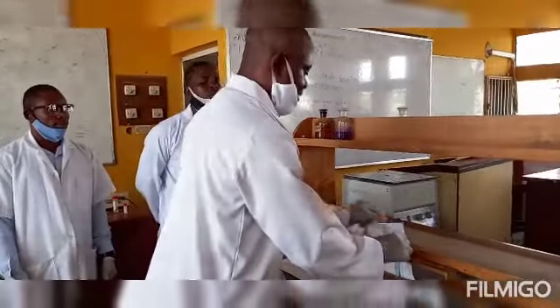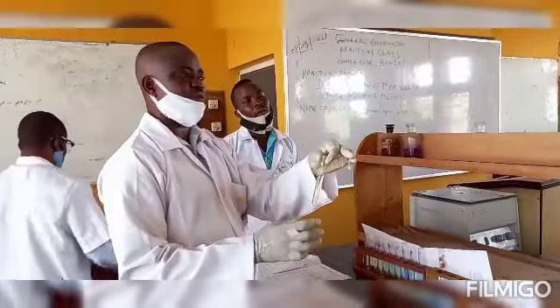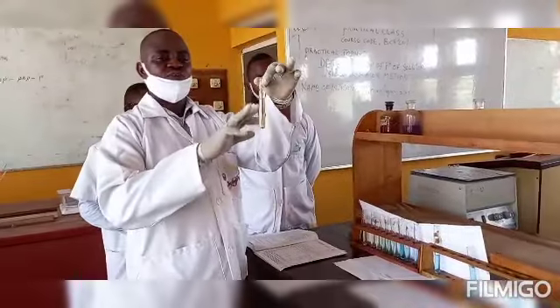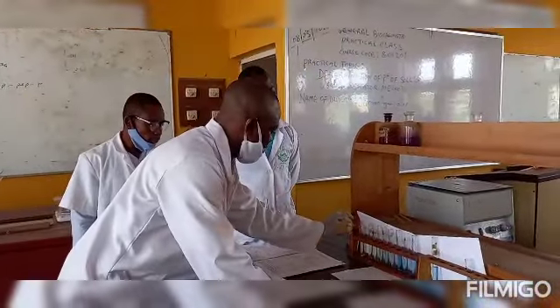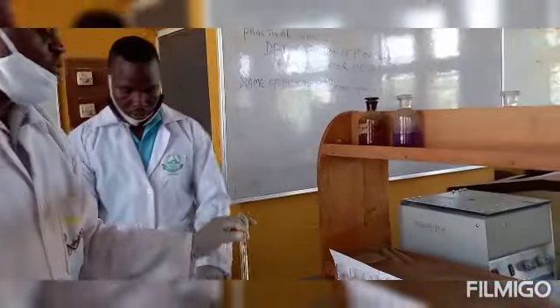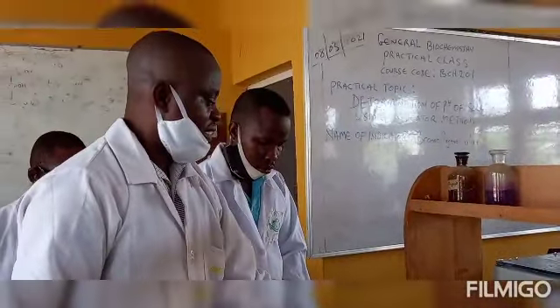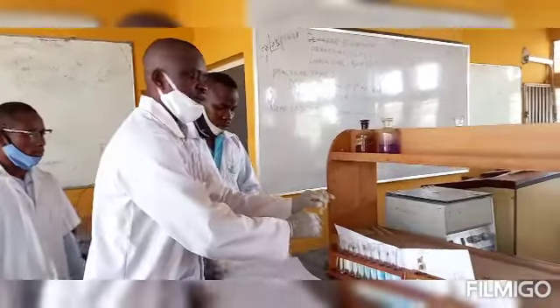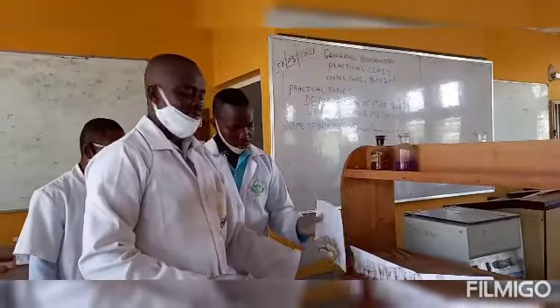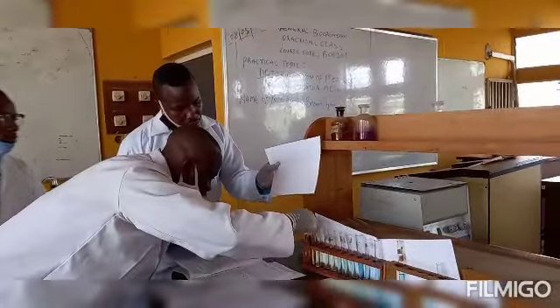Now to our test. The first test here is our urine sample that we don't know the pH. What we will now do is begin to match the color that developed from this urine sample. We call it color matching, one by one, with each of the test tubes. Whichever test tube the color of the urine sample tallies with, that means the urine sample prepared there has the same pH as that particular standard. So let's begin the matching for the urine sample.